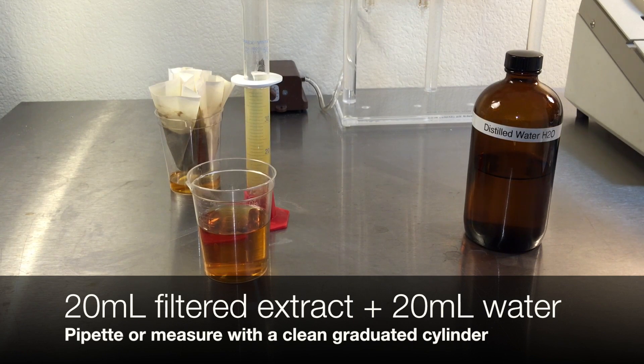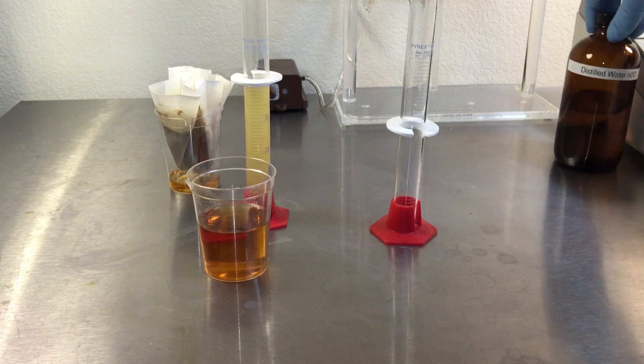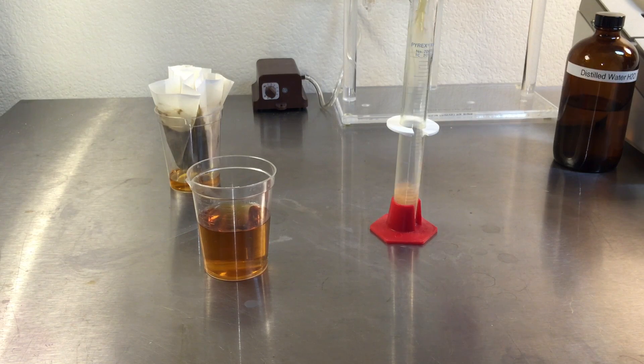Combine 20 milliliters of filtered extract with 20 milliliters of purified water. Mix well by pouring back and forth at least three times into a clean vessel.